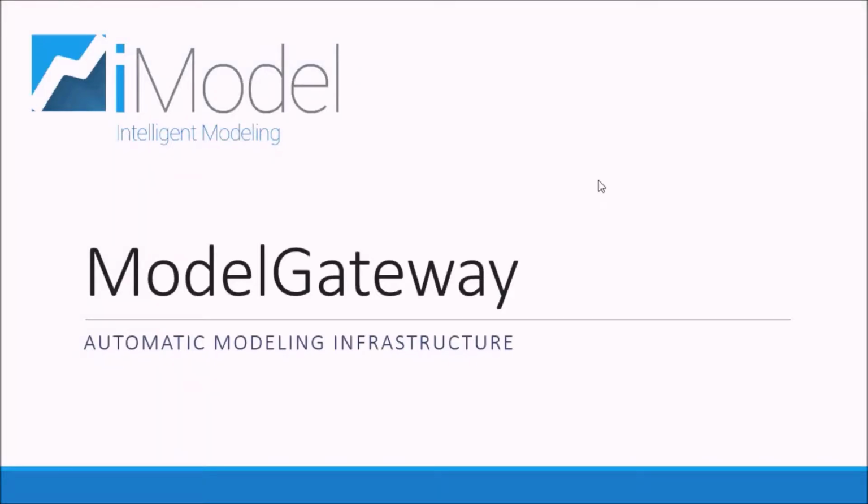Hi, in this video I will now show you a quick overview of the Model Gateway software. Model Gateway was built to automate modeling in online analyzers. It is done by AI algorithms that build chemometric models automatically with no manual operations required by the user. It's a software product with a small footprint that can connect to any analyzer, NIR, Raman, NMR, or any analyzer that requires chemometrics, and it takes care of the modeling, the prediction, and DCS communication.